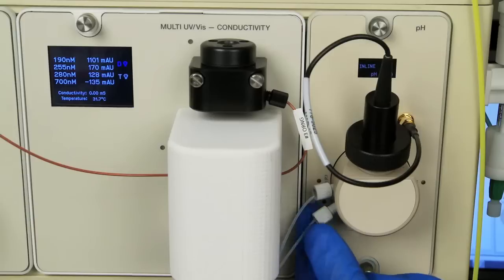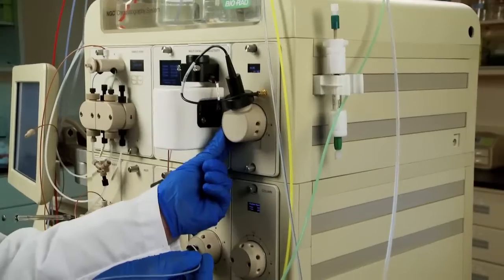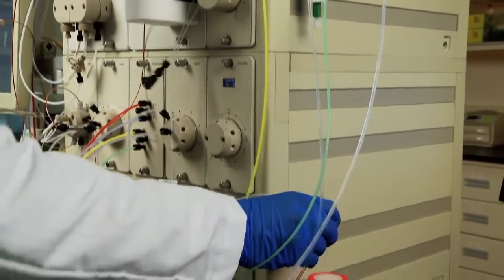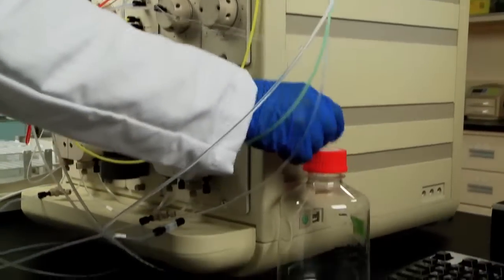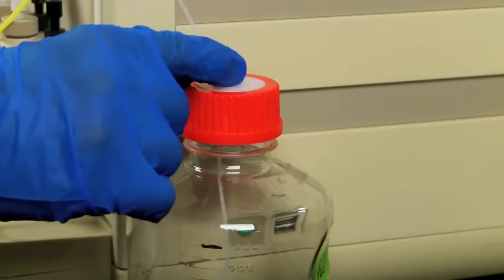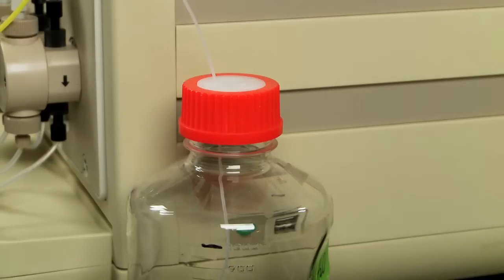Connect the waste tubing to the calibration waste port, labeled CAL OUT, on the pH valve, and immerse the open end into a waste container. The waste container should be placed next to or below the NGC. Do not place the waste container on top of the NGC.